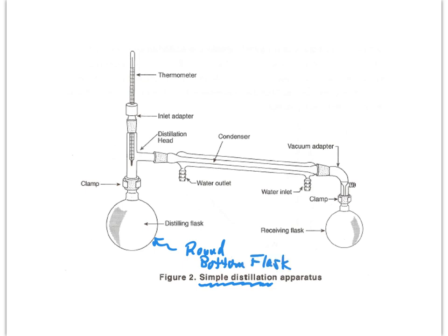And these flasks that we use, remember that your glassware kits are in the cabinets on each side of the work islands in the lab. Be careful because some of them, the latches are broken, when you take them out. Keep them flat. We don't want to drop a bunch of glassware on the floor. It doesn't bounce well.